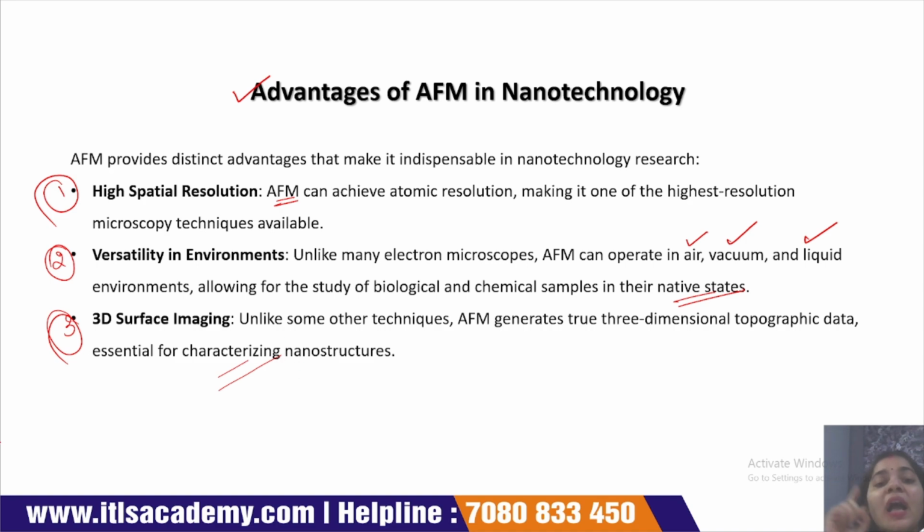Okay, there are a lot of advantages of AFM in nanobiotechnology. First is the high spatial resolution. With the help of atomic force microscopy, we get a high resolution image at a nanoscale. Next is versatility in environment. AFM can operate in air, vacuum, and liquid environments very easily.